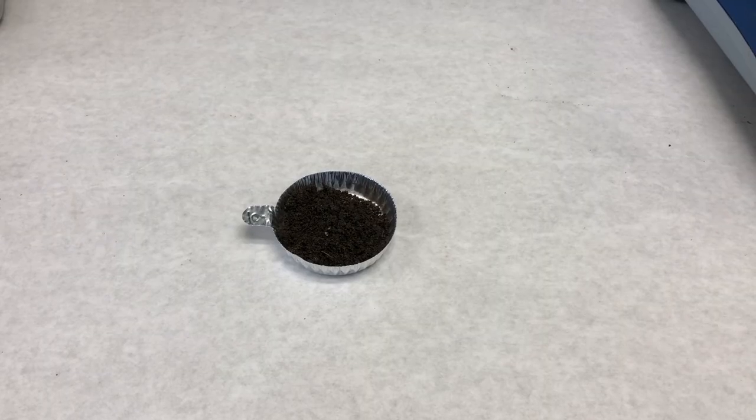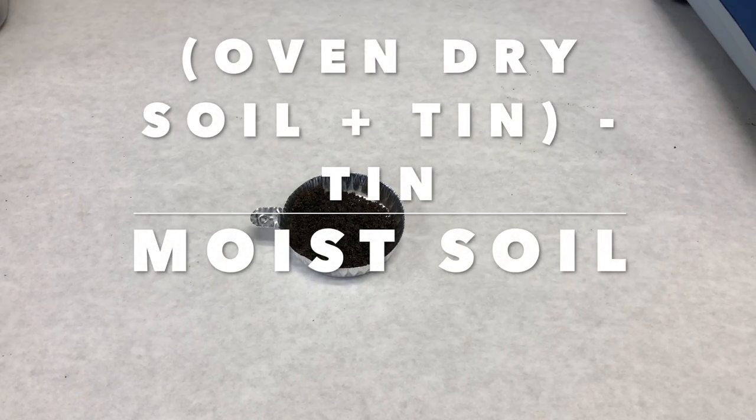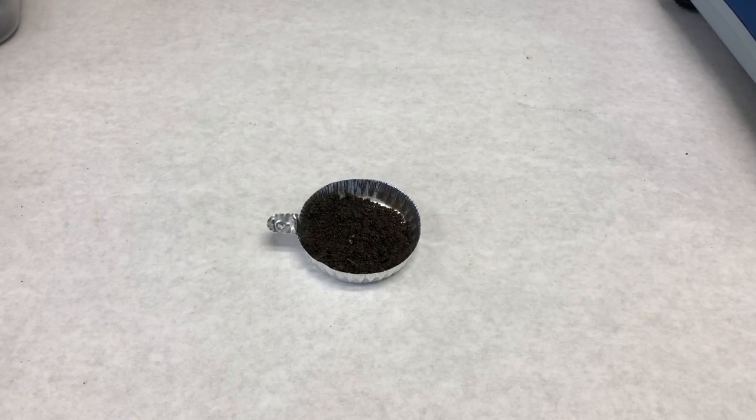Place the soil into an oven for at least 24 hours or until the sample stops changing weight. After oven drying, re-weigh the tin and soil, subtract the weight of the empty tin to obtain the weight of the oven dry soil, and divide this weight by the moist soil weight to obtain the moist soil to oven dry correction factor.